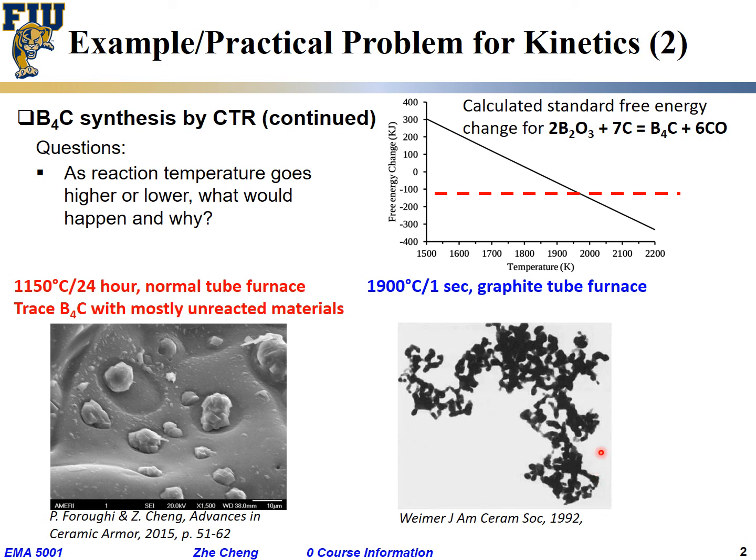Okay, they are no longer using SEM. They are using a transmission electron microscope, TEM, which can go to even higher magnification than SEM. And what they observed is roughly 20 nanometer, uniform, consistent nanopowder. I don't have the scale bar here.